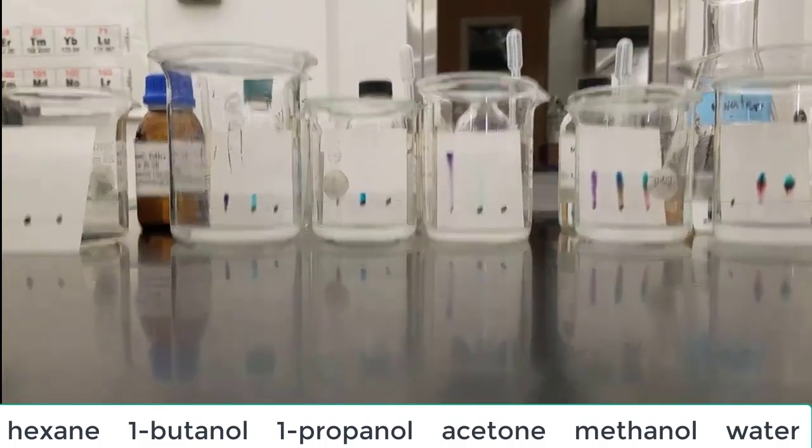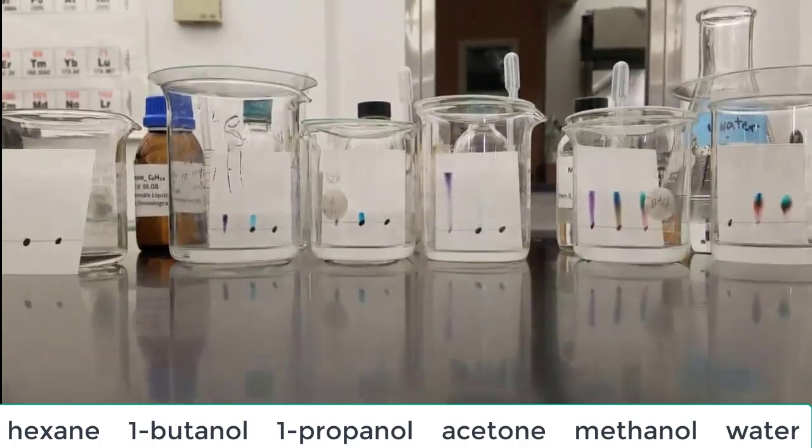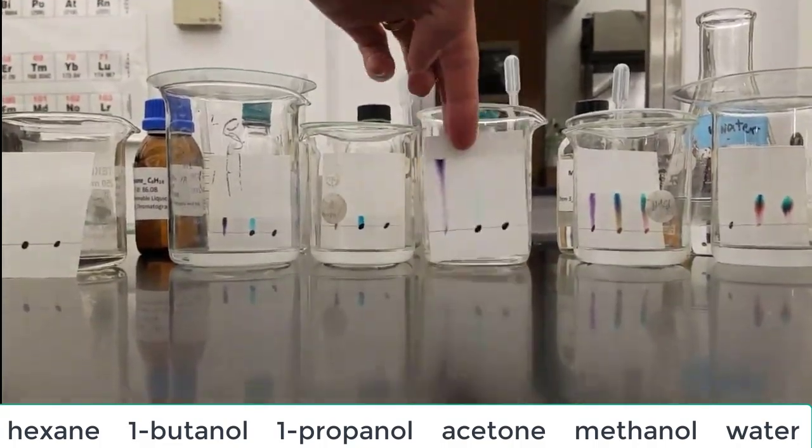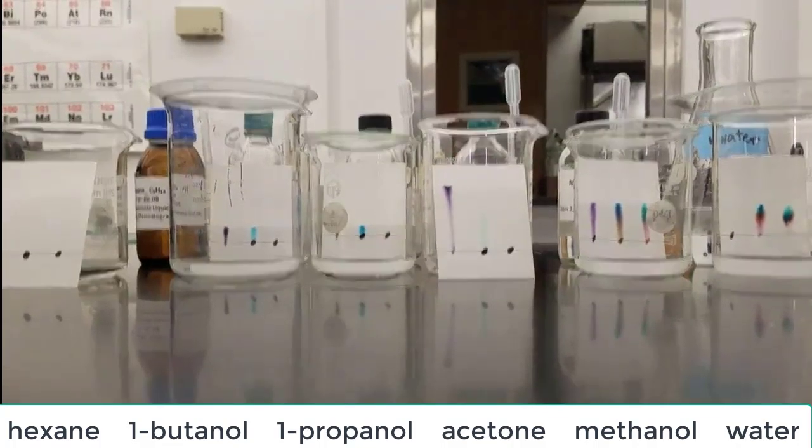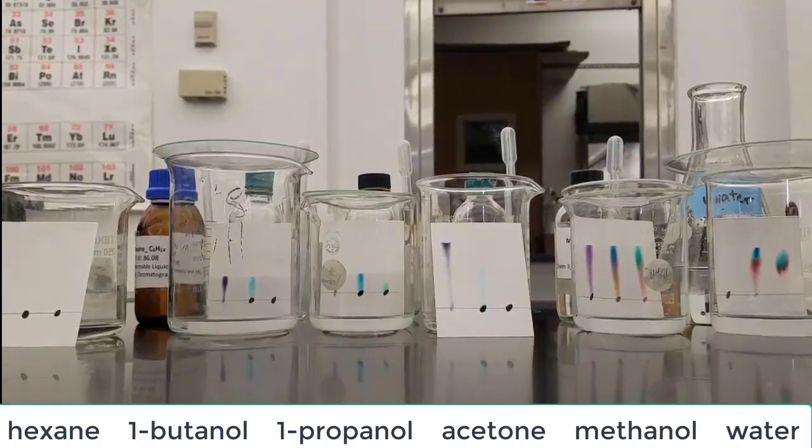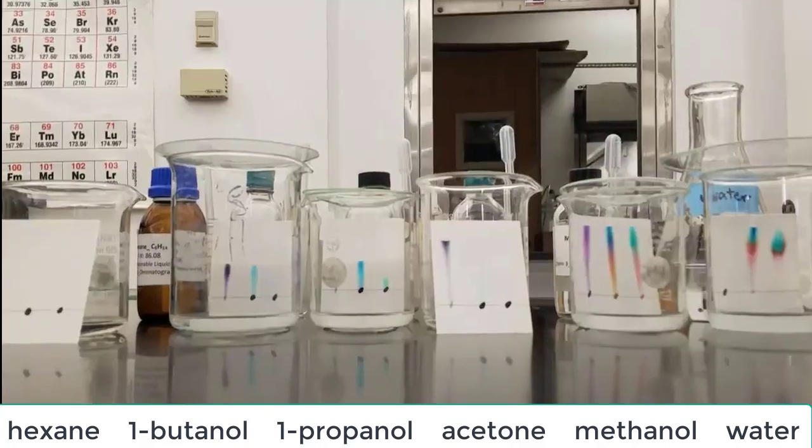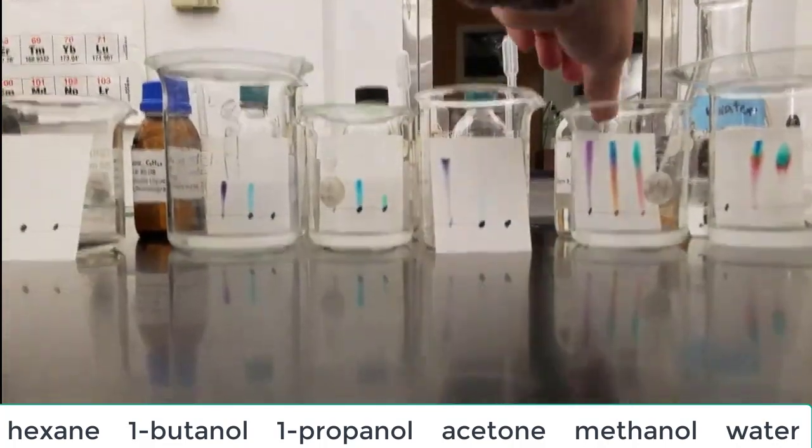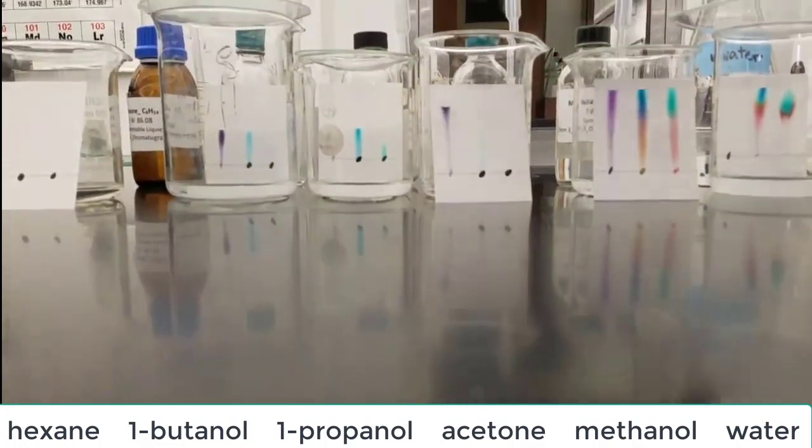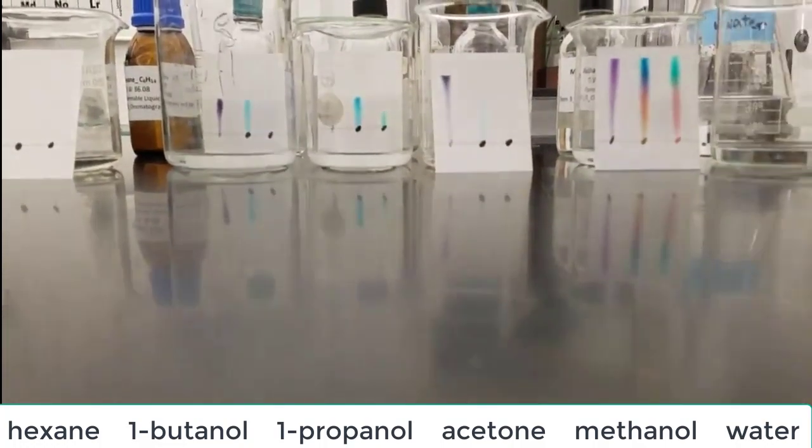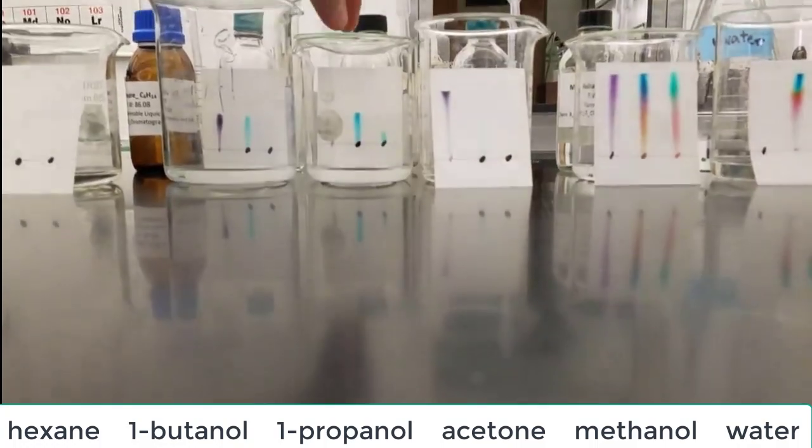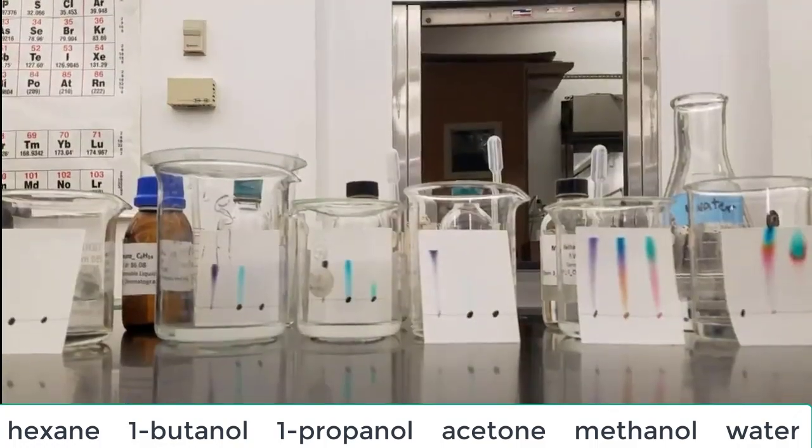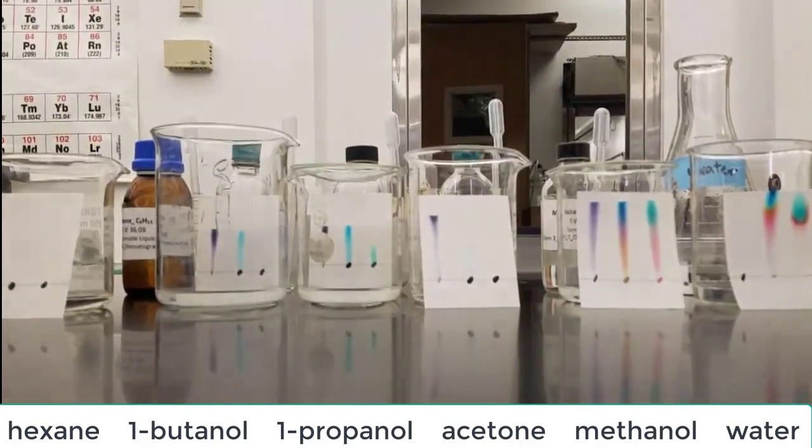As that solvent gets towards the top of each paper, about a centimeter or two from the top, we're going to pull the papers out. There are measurements you can do with these chromatograms that we won't be doing, but in order to measure correctly, you need to pull it out before that solvent runs off the top of the paper. We can see different separations for some of the inks, which shows that it's not all the same pigments in every black ink.